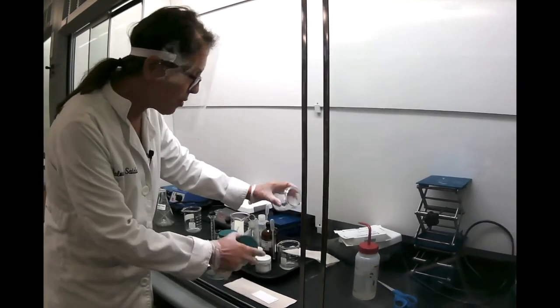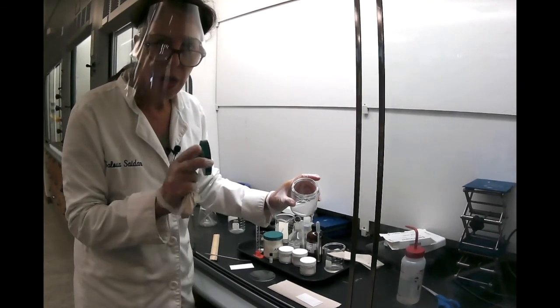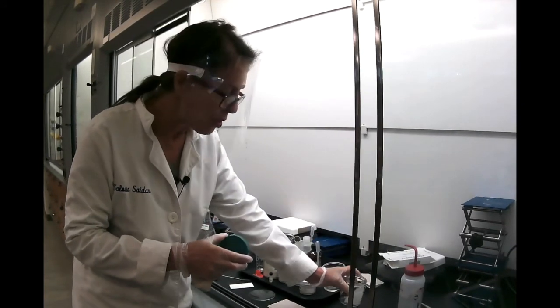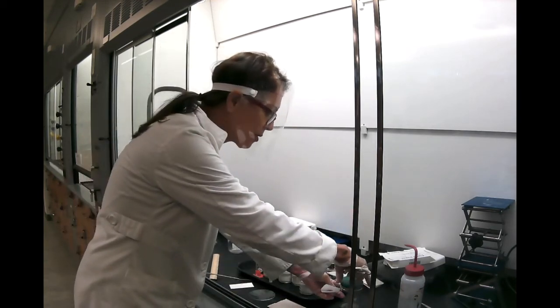and you can discard the filter paper. We should discard it, and we have in the fume hood a container that says solid waste. So you can take your filter paper and put it in the solid waste.